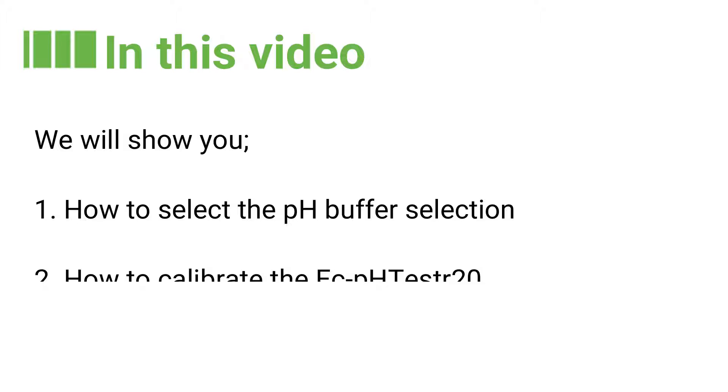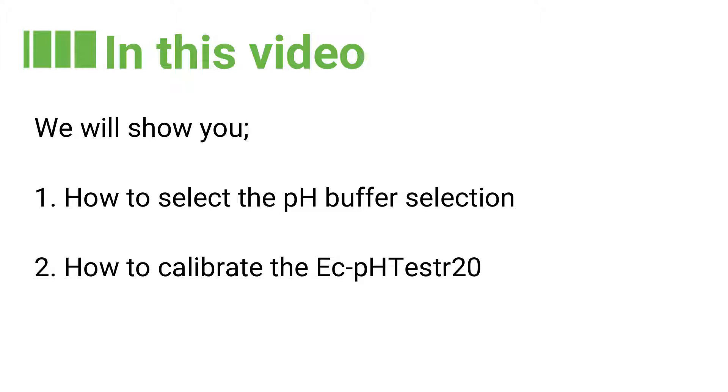Hi and welcome to another support video from Instrument Choice. In this video we will show you how to set up the pH buffer selection and how to calibrate the EC-PH tester 20. So let's get started.